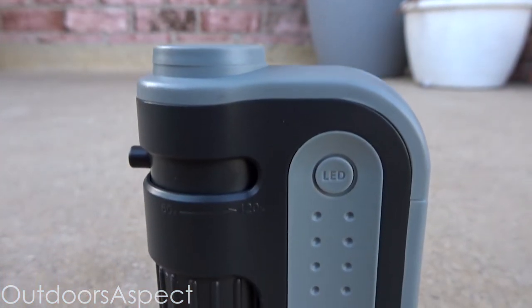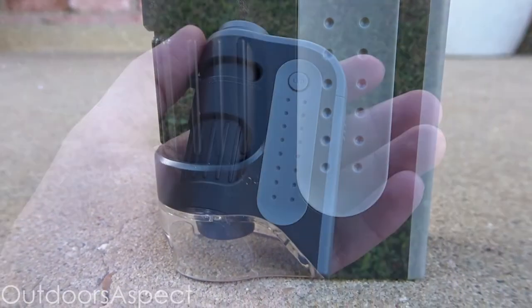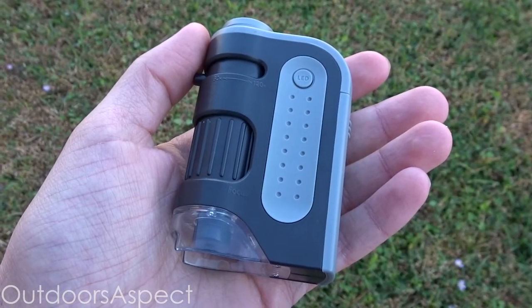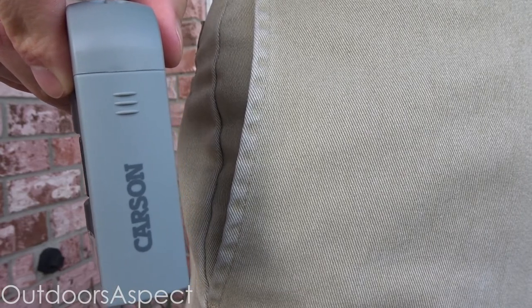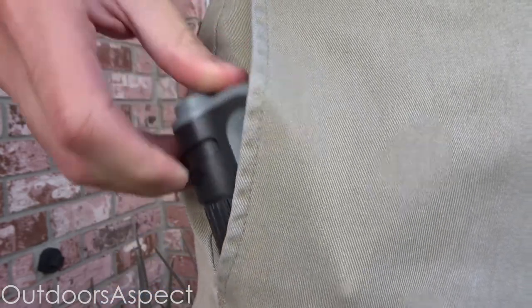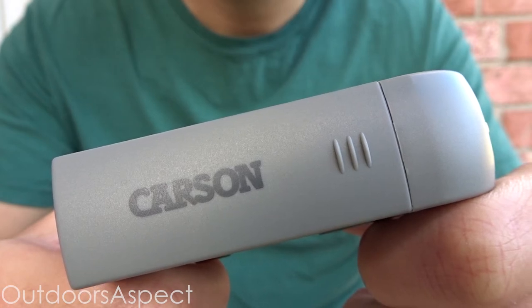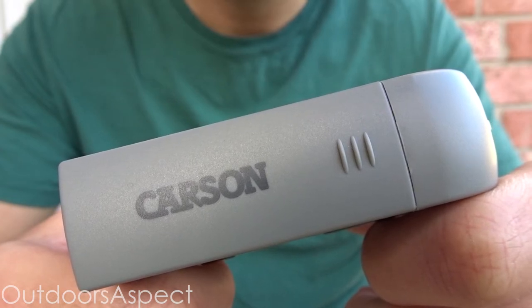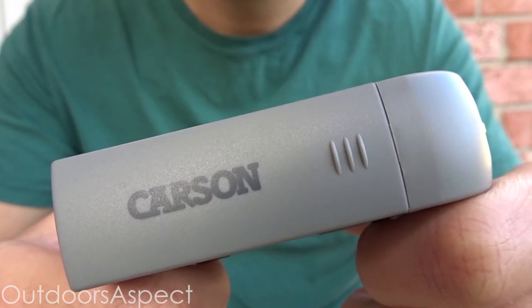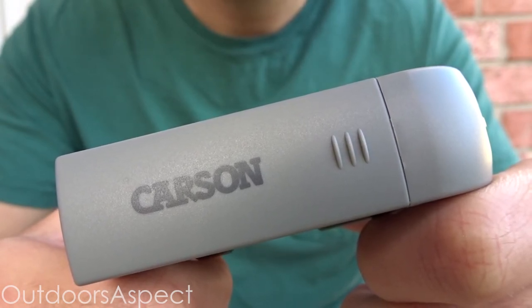My final thoughts: I would highly recommend giving this microscope a try. If you're a fanatic like me who absolutely loves the microscopic world, I'm 100% confident you would love this product. It's a really cool tool to have around, and what's great too is that it's small enough to fit in your pocket. Whenever you're out and see something interesting, just take the microscope out and take a look. For $14, the stuff you can see is crazy — I've had it since 2018 and still use it to this day. It's a lot of fun and at a very low cost.